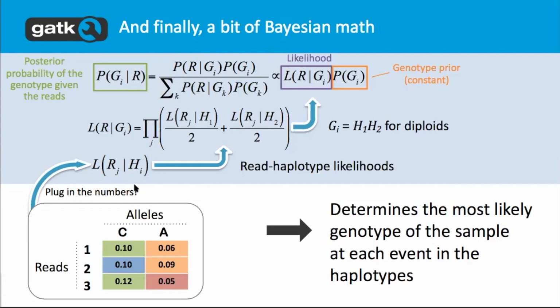But if you're working with something that is not diploid, whether it's haploid or a fun polyploid with something exotic, that's totally okay. There's a parameter that you can give HaplotypeCaller to tell it, I have a tetraploid, please look at 4 possible alleles at this step. And so at this point, we'll just have more terms in the equation and take that into account. And that's how that works. So again, diploid by default, but if you want to use a different ploidy, you can set that.